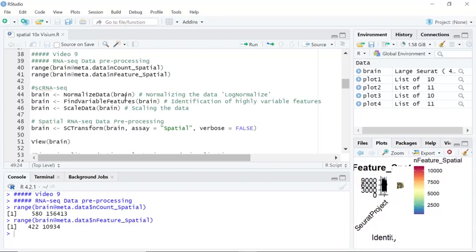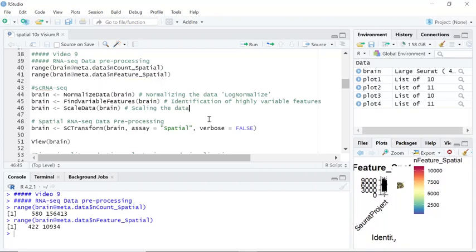During single cell RNA sequencing data analysis, we perform three steps for preprocessing: normalize data, find variable features, and scale data.